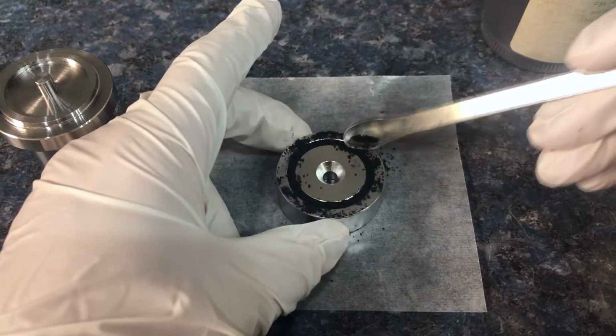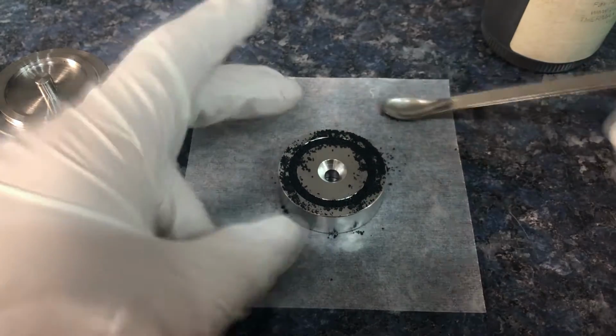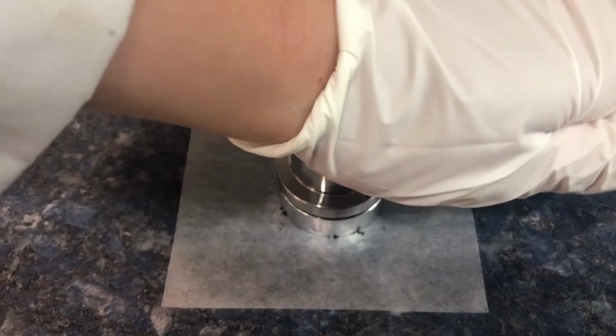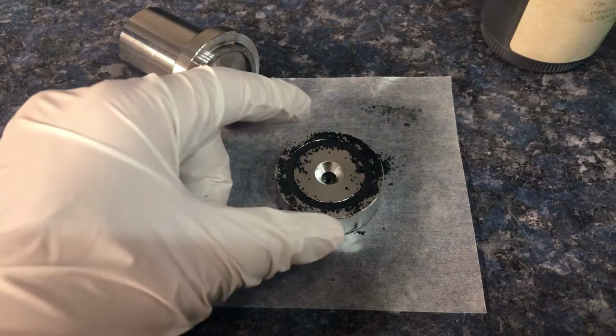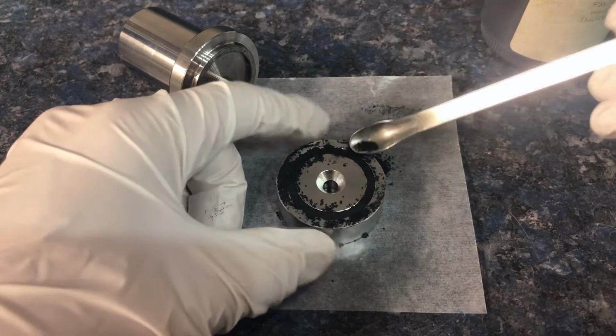The next step is to press the material down to flatten it out somewhat. You can then use the die by hand to press the material down even more. The die is self-centering because of the alignment hole. By pressing the material down, you can add in more. It works better if you build it up by layers rather than pressing it all together all at once.